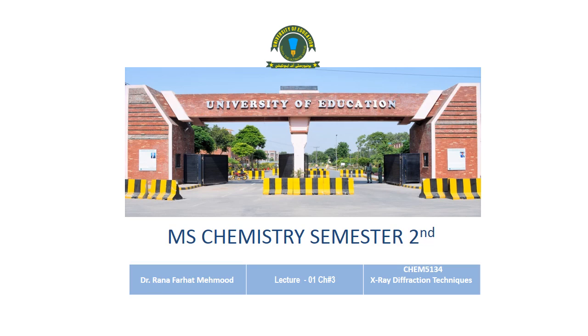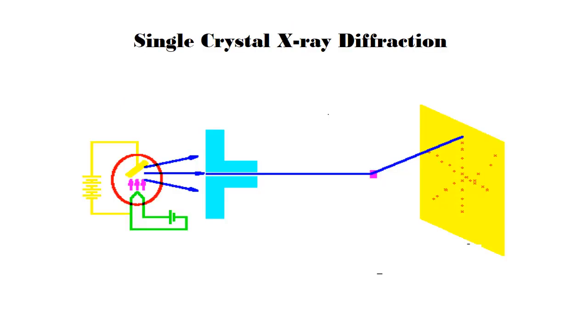Dear students, now we are going to discuss our chapter number 3, which is X-ray diffraction techniques, and the lecture number is 1. Single crystal X-ray diffraction, the topic which is being discussed here today.